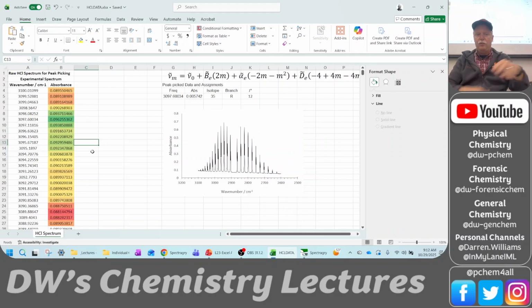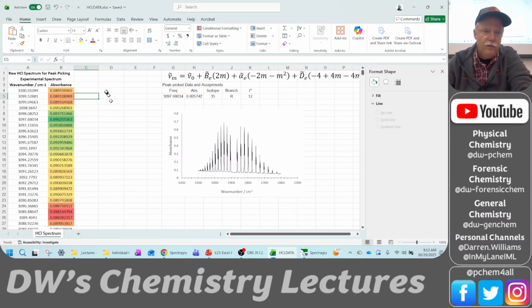In this window, we have some peaks. Another way to do this is to put in an if-then statement. I'm going to call this a flag, and I'm going to do a search of 5 data points.